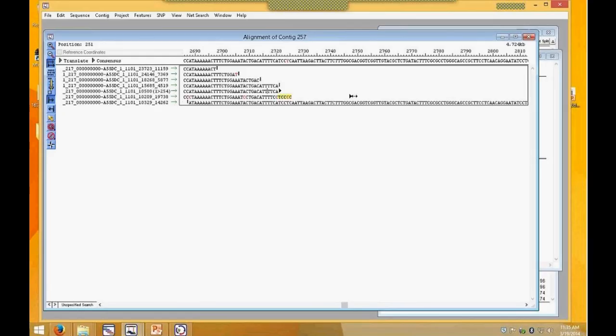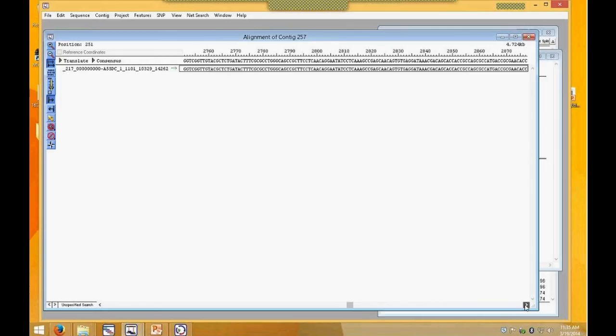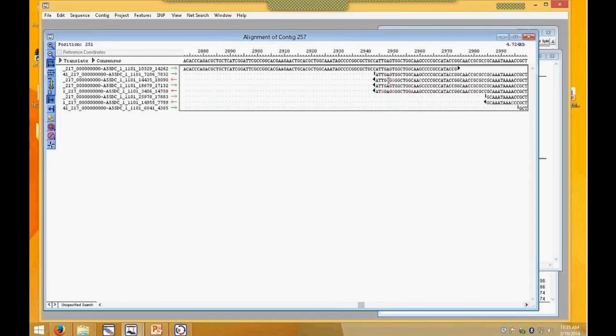Now, if I extended and saw a lot of mismatch, like that one has more mismatch, I'm not so sure. I might look at a region like this and say, well, maybe that's a problem. Let's go to the other side. And here we see a little bit more mismatch in there, so we can see why it trimmed back. Something's going on there.